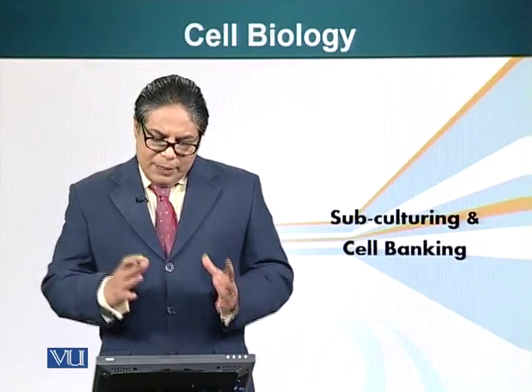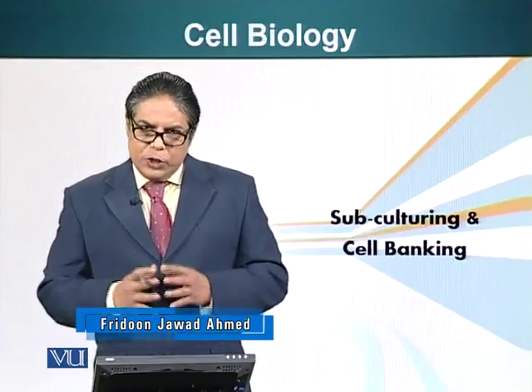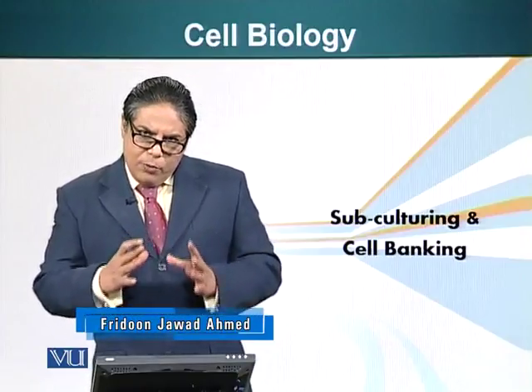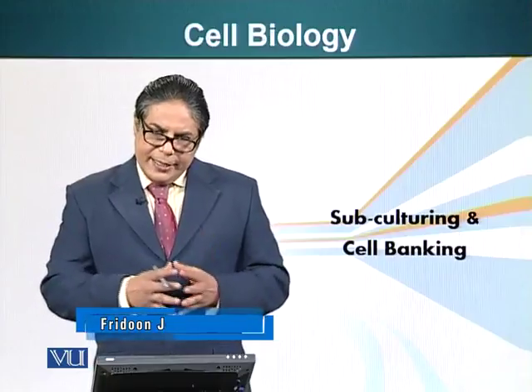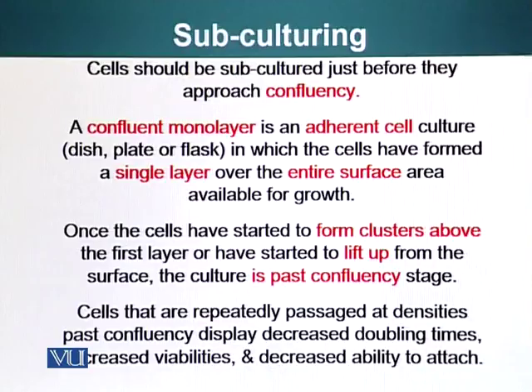Now let's talk about subculturing and cell banking. It's an important part of tissue culturing. Although you may not be using some of these things directly in the lab, it is important to know these things. Cells should be subcultured just before they approach confluency.